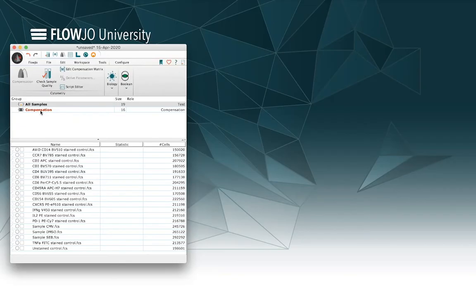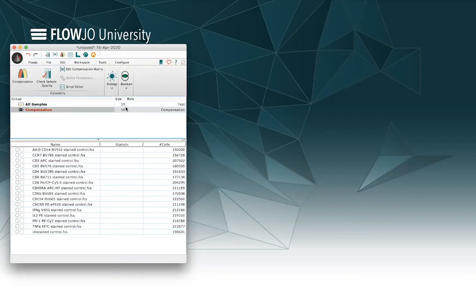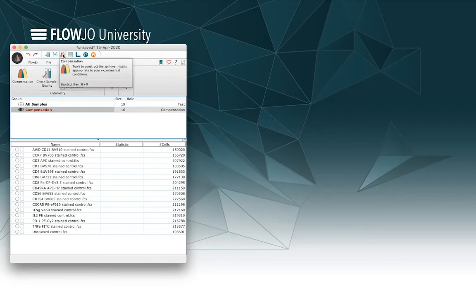The other thing you've got to do is actually select the compensation group. So now that we've selected the compensation group, you can see the compensation icon here in tools is available and also at the top of the workspace. So now we're free to go ahead and select compensation.